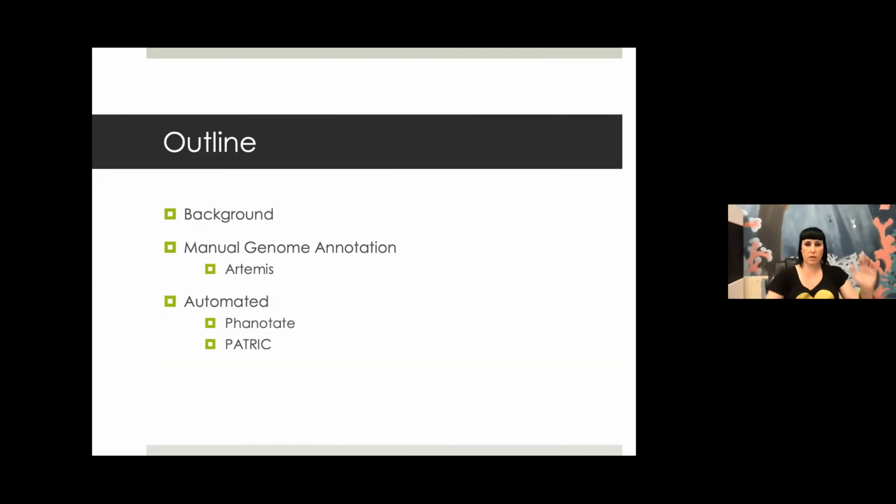So a little bit of background. I'm going to be covering some very introductory molecular biology of phage genomes, and techniques of molecular biology and how they relate to PHANOTATE. This will be important for both manual annotation as well as verifying automated annotations. Verifying automated annotations is important because programs aren't always 100% correct. Certainly not my program just yet, but I'm trying to get it there. Usually you have to manually annotate after you've automated, to go back and remove any false positives or add any false negatives.